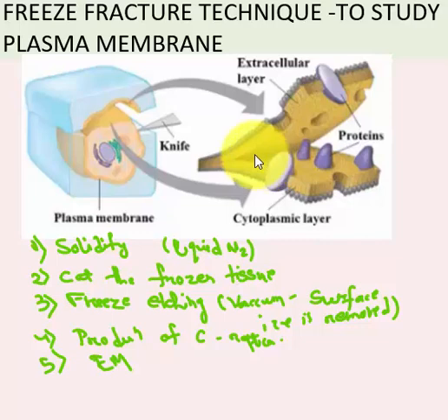So the purpose of this freeze fracture technique is to visualize the inside of the membrane, particularly the ultrastructure of the membrane interior, the pattern of the integral membrane proteins. So this is all about the freeze fracture technique.